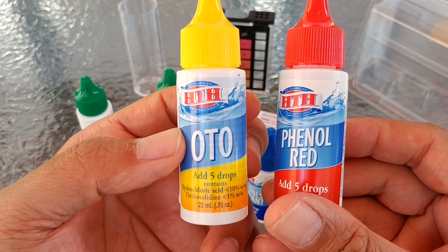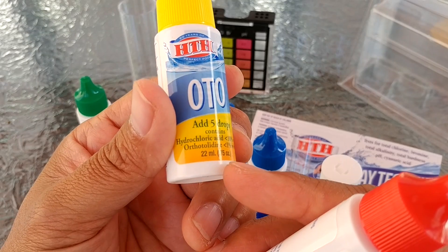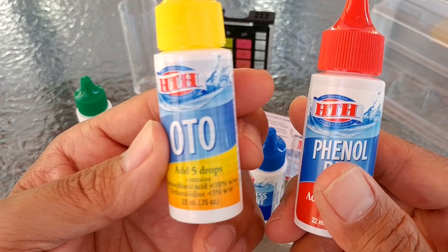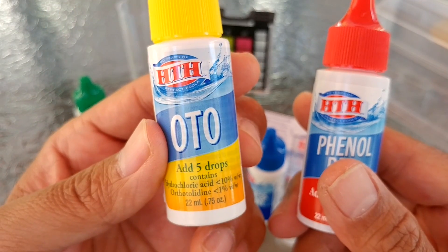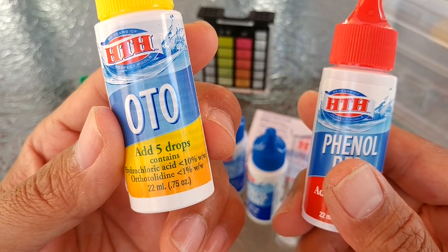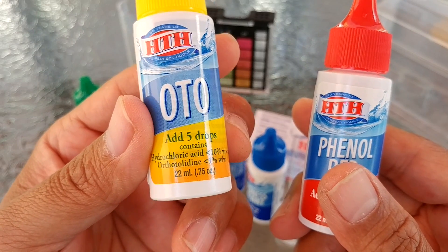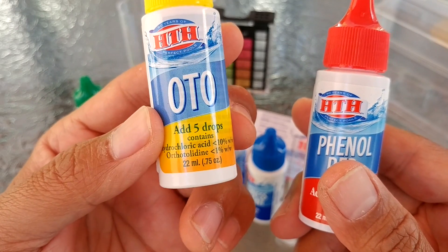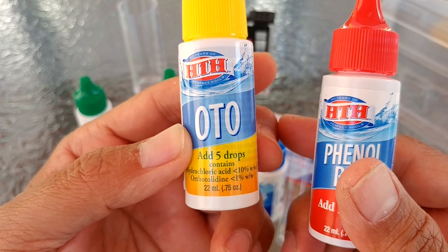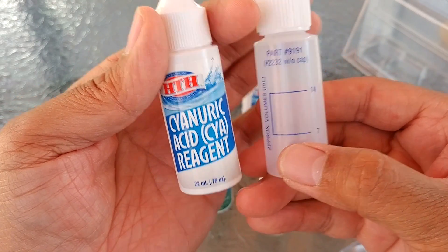Each bottle only asks you to do five drops for the chlorine, bromine, and pH tests, so you should be able to do a total of 88 tests. Each bottle comes with 22 ml, and according to liquid conversion you should have 20 drops per ml — so 20 drops times 22 ml equals 440, divided by 5 drops per test, that's 88 tests.